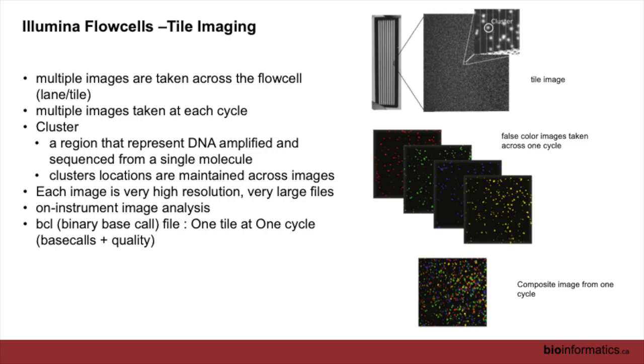So what's happening is every time a cycle goes by, as we do sequencing by synthesis and new bases are introduced, high resolution photos are taken all across the flow cell, across all these tiles. And within one of these tiles, you can see each cluster, which ideally represents a single fragment of DNA that was captured and amplified, is represented many times across that tile. So multiple images are taken with each cycle, and the instrument computer is analyzing this as it comes off.